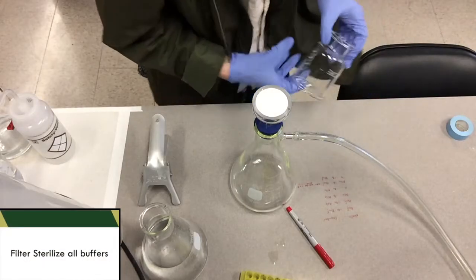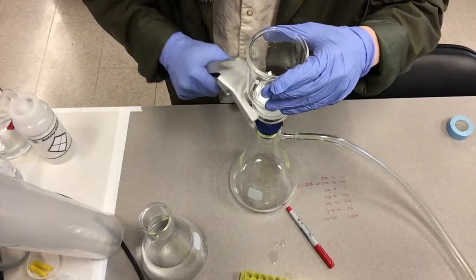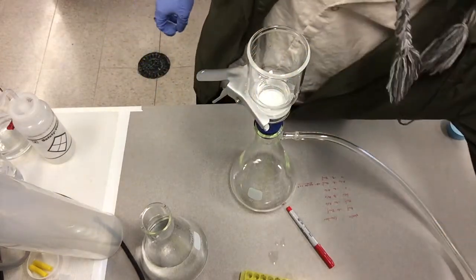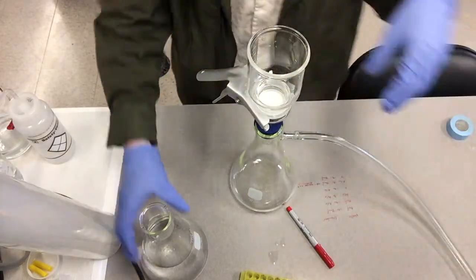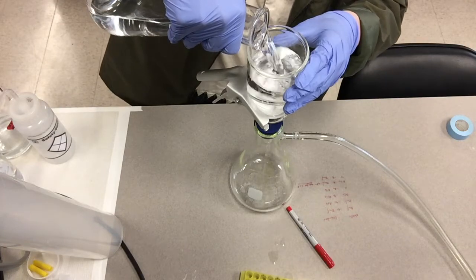The first thing we're going to do is filter sterilize all of our buffers. This is important because we don't want any filaments or any pieces of material to come through and destroy our column, so it needs to be as clean as possible.